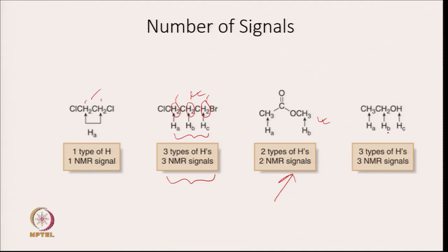Whereas in this compound there are 3 different kinds of protons. These 3 hydrogens have a different environment in comparison to these 2 hydrogens and this hydrogen.